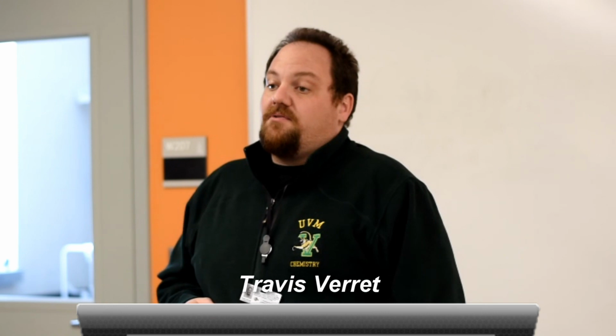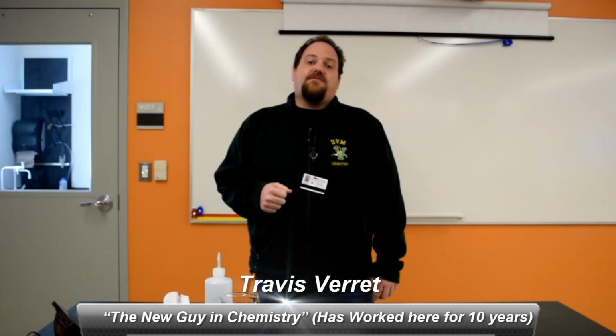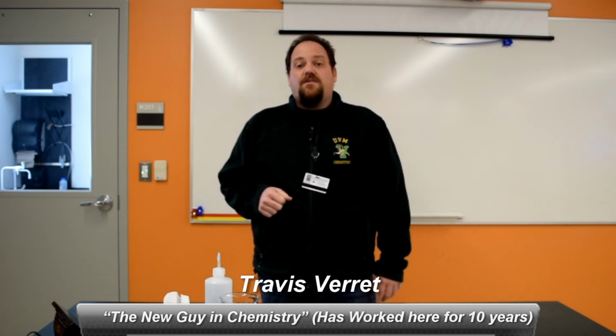And in this week's lab, we are going to be looking at the freezing point depression of a bunch of different solutions. And we are going to be using the freezing point depression to determine what those solutions are. Now, if you think about it, when they put salt down on the roads up here in Vermont, we're using the freezing point depression of salt water to melt the ice on the roads back into water. And we're going to be using that property to determine what the identity of these unknowns are.